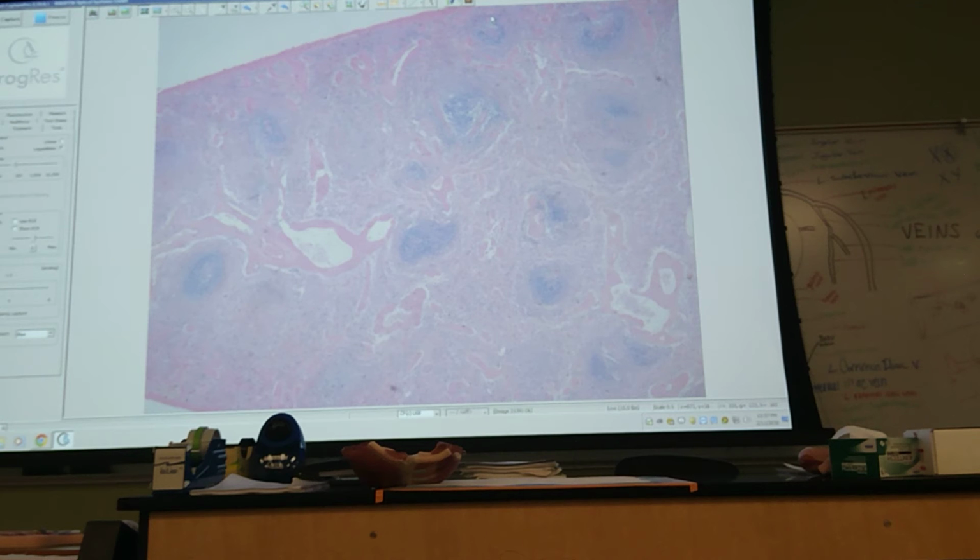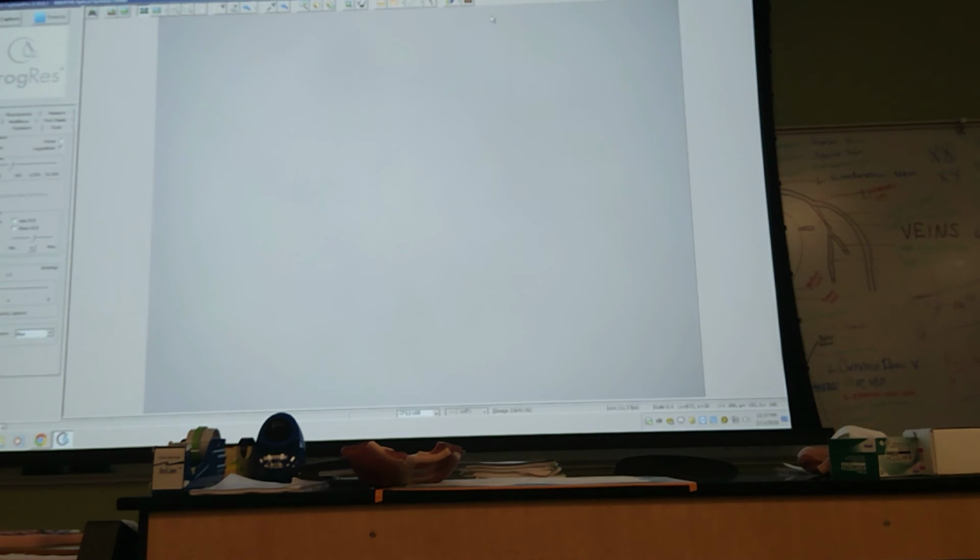All right. Now, let me skip one, and then we'll come back to the one I've skipped. We're going to go to the thymus. You have to turn the page to go to the thymus.